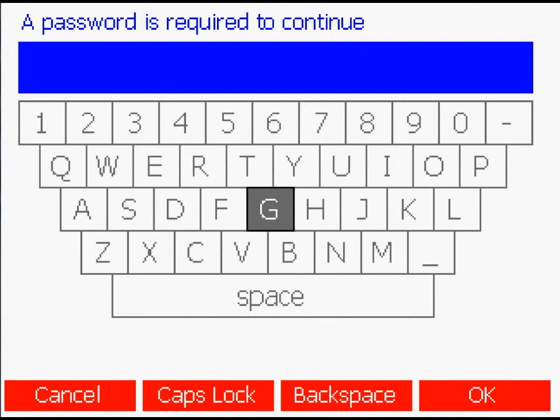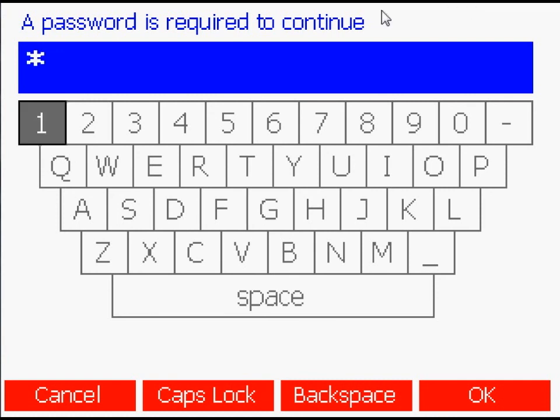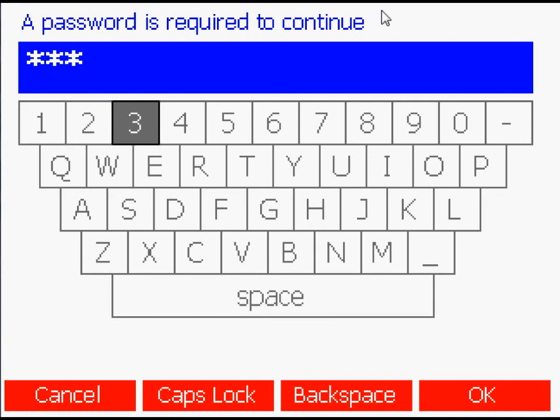Adding a probe. Adding a probe and some other functions are password protected. A soft keyboard will appear and you will be asked to enter a password before proceeding. Use the arrow keys to move around the keyboard and press enter to select a character.